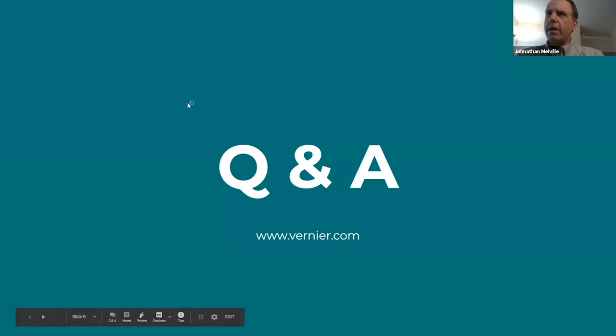I would say I can answer integrating Vernier sensors. The key thing to know is that they only work with the GoDirect sensors. So the sensors do have to be the GoDirect ones. It also only works right now, I believe, over USB and on PC. But the sample data exists across all instances. So the sample data is there across everything, even if you're on a Mac. But to actually collect data into LT, you need to be using the USB port on the GoDirect sensors, and you need to be using the PC platform.